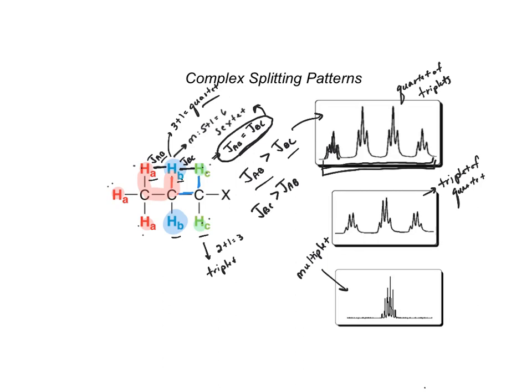So for our intents and purposes, we're going to assume, especially for a lot of these plain methyl and methylene protons, that these guys are equal and we can just treat them all the same. We'll expect a sextet for HB, but just note that that's not always the case, and it does depend on the value of the coupling constant between the two different sets of non-equivalent protons.